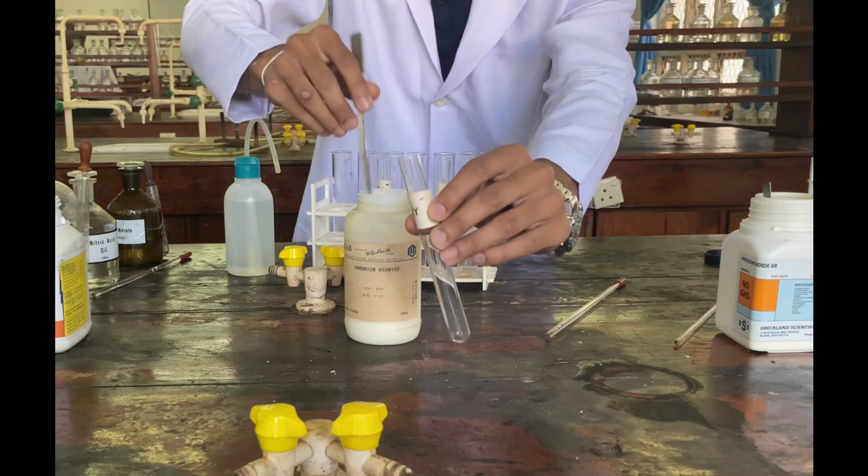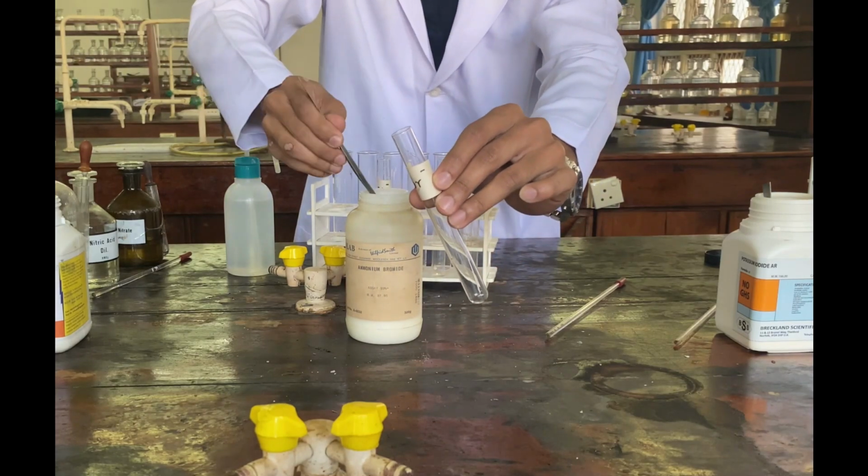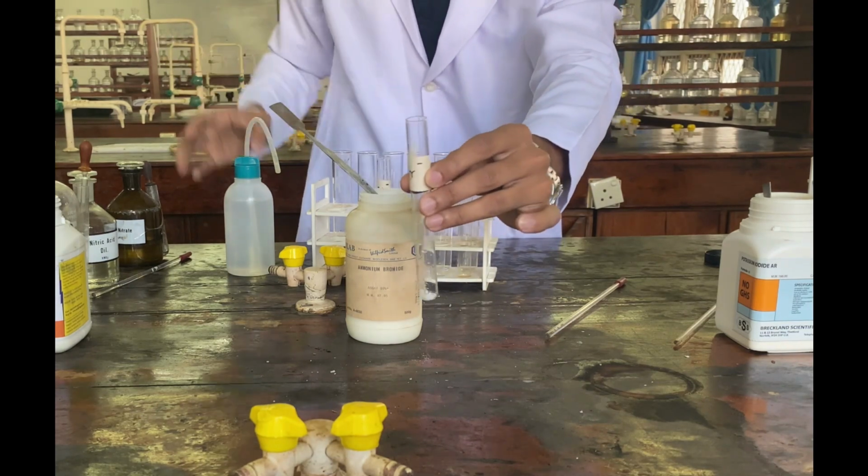Next, take a small amount of ammonium bromide into a test tube and add a little bit of distilled water, then make aqueous solution of bromide ions.